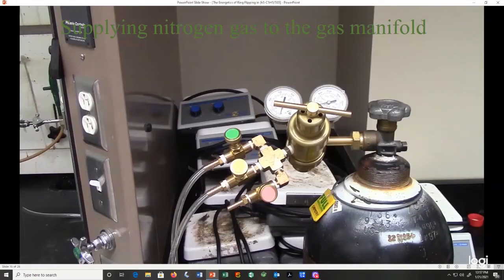Supplying nitrogen gas to the gas manifold. As stated before, we have a 2-stage regulator here, and this gauge is going to tell us how much pressure is in the actual tank, and this gauge is going to show us our exit pressure, and we can control that with this valve here. If we turn this counterclockwise, we can get to where there's no pressure exiting the system.